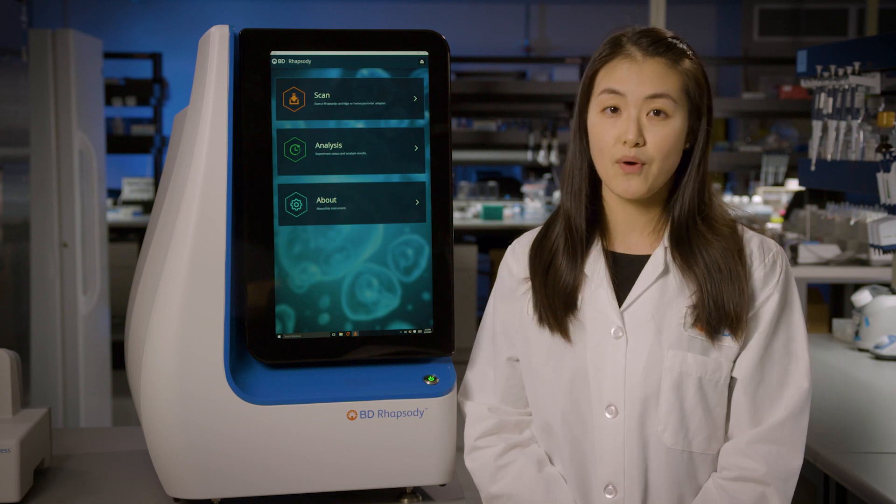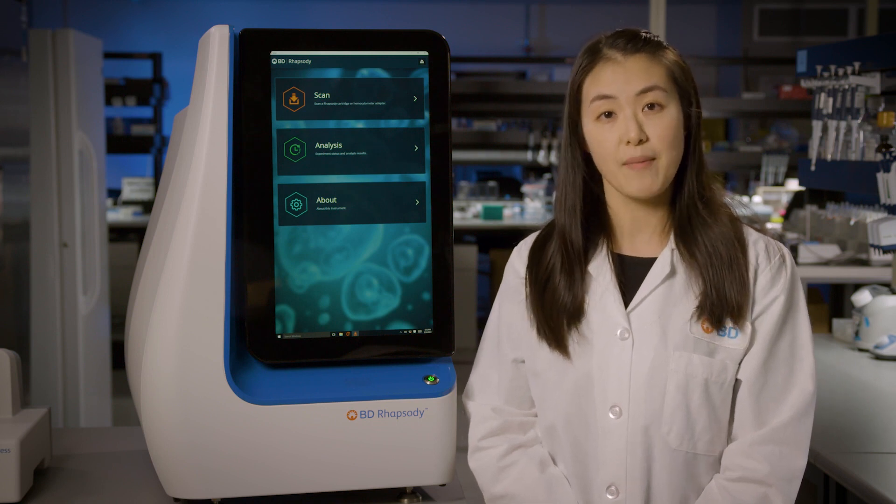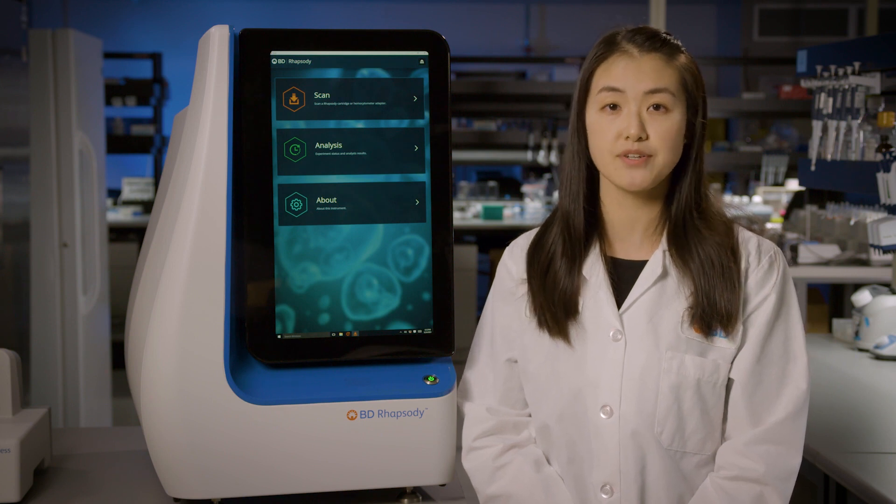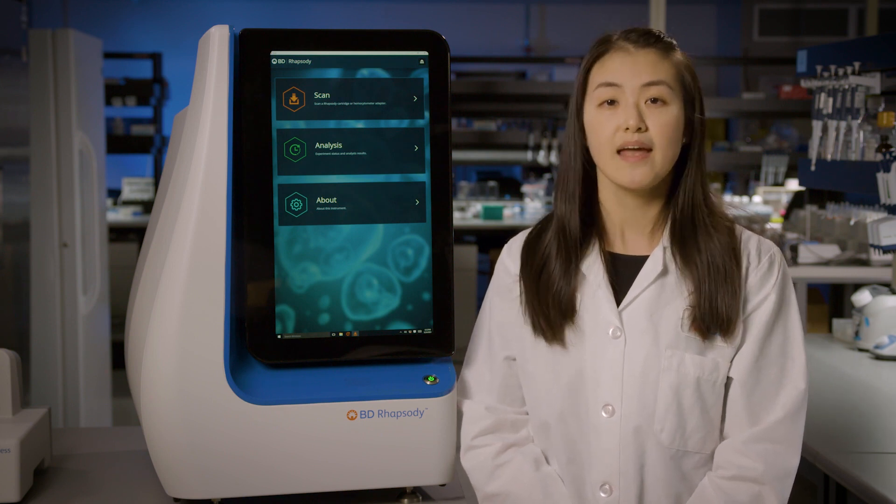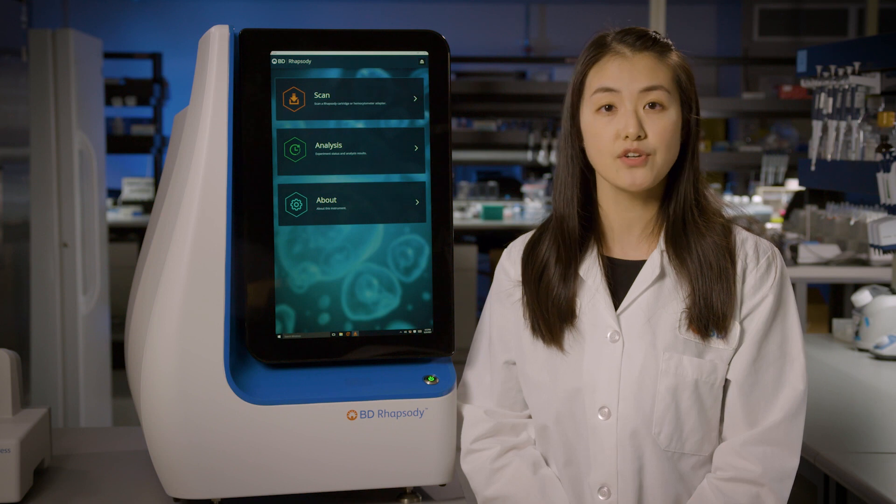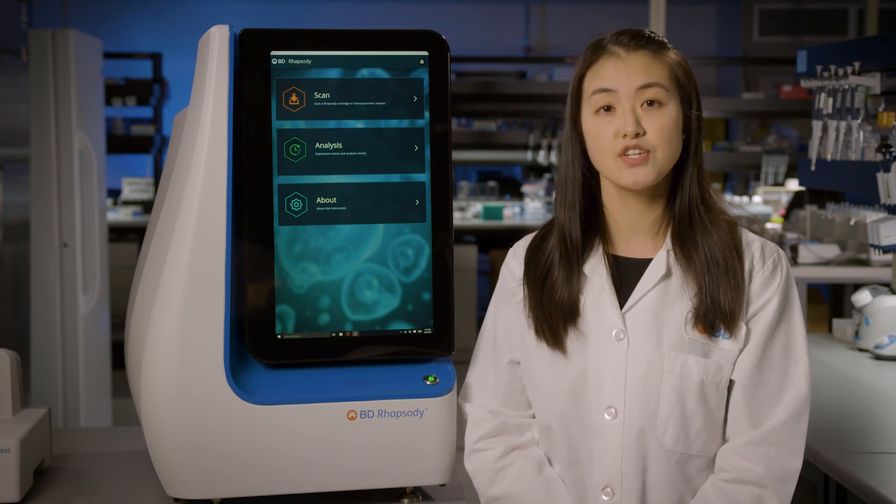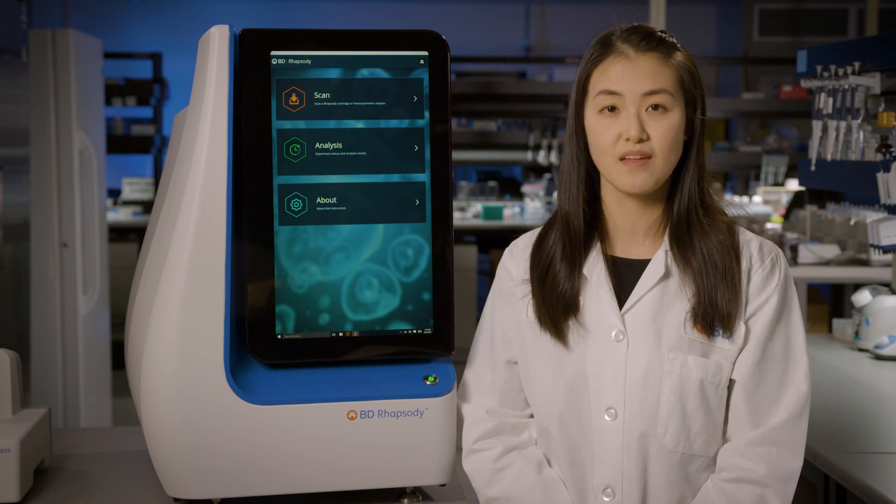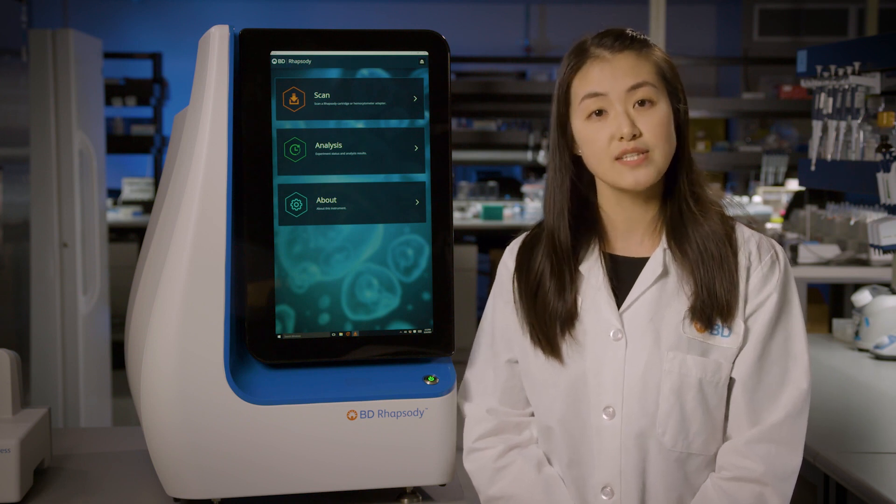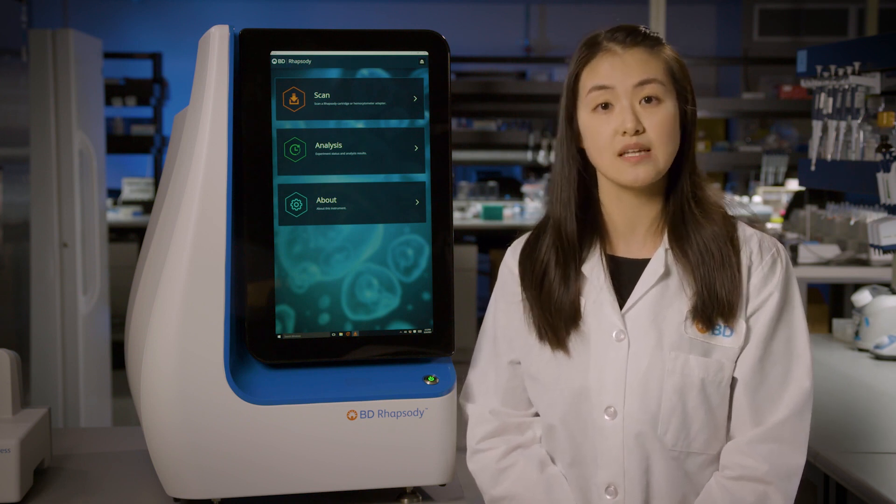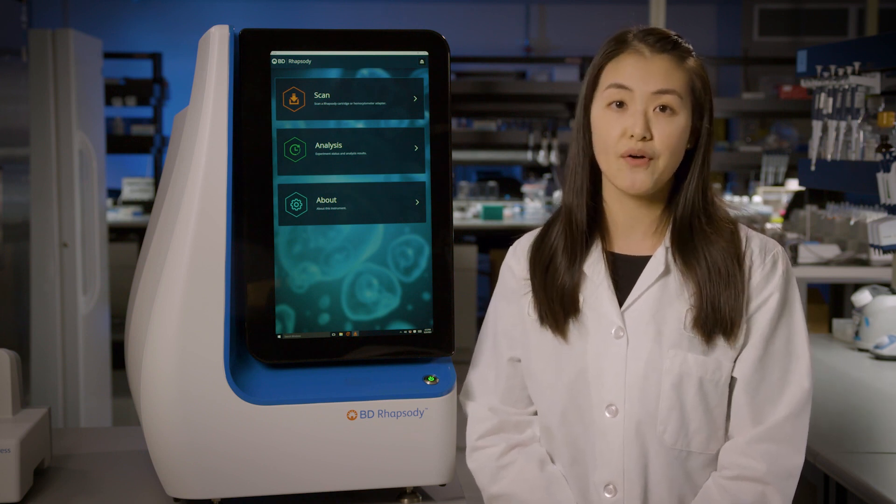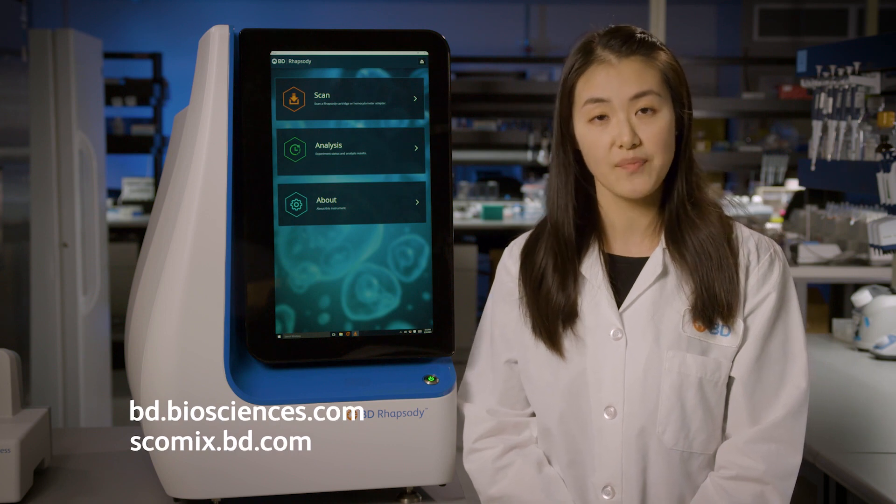The BD-Rhapsody scanner reports quality metrics in real-time at each step of your single-cell assay from initial cells captured to bead retrieval. In this video, we will demonstrate how to use the BD-Rhapsody scanner to check the quality of your single-cell multiomics experiments. For detailed steps of counting and capturing single cells using the BD-Rhapsody Express single-cell analysis system, check out our tutorial at www.bdbiosciences.com or www.scomix.bd.com.